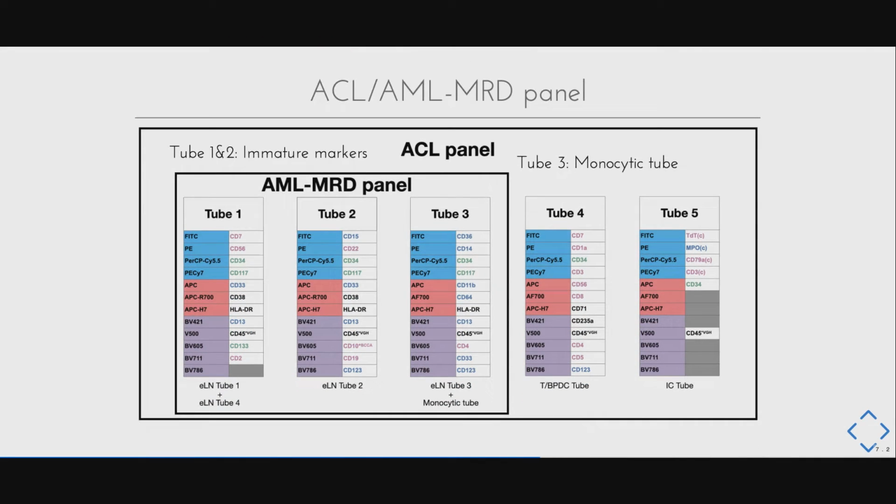So here's our AML-MRD panel. Same thing as the LPD. So first is a panel. We use tube 1, 2, 3, the first 3 tubes, as our AML-MRD panel.